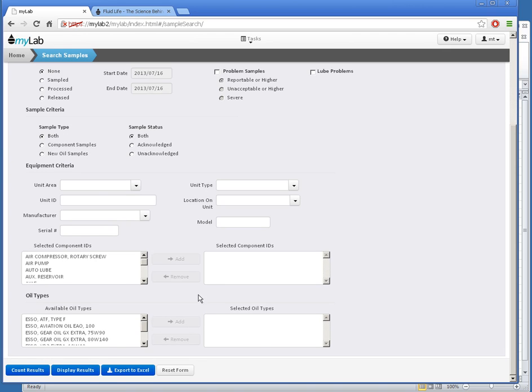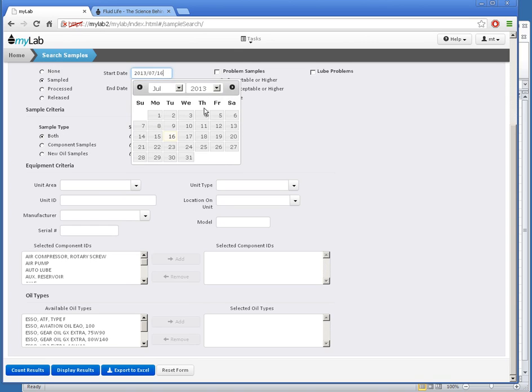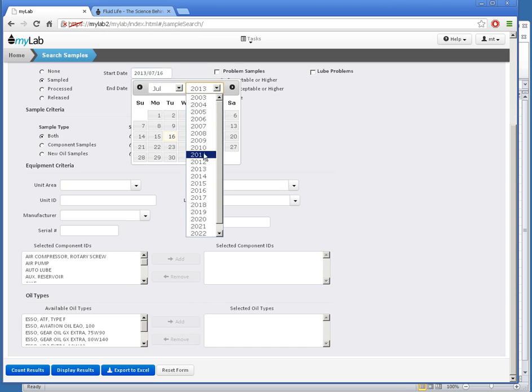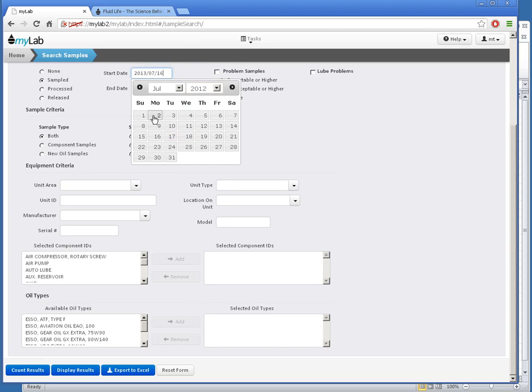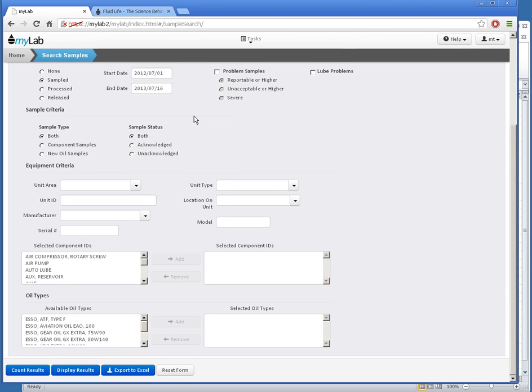Let's work through an example. I'm only interested in samples taken last year, so I'll set that. I only want severe problems on Caterpillar engines.